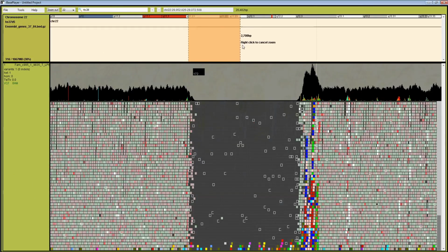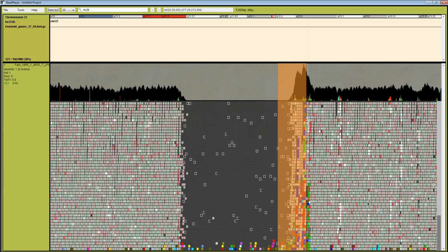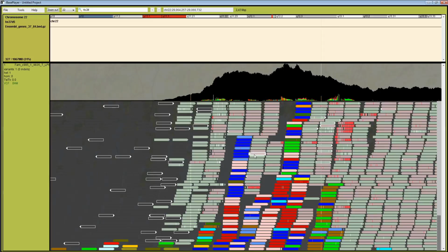Okay, so here you can see a around 6,000 base pairs long line1 element, and the reads are in dark grey because their qualities are 0, so their alignment isn't unique. Okay, but let's look at this flanking region where we have lots of discordant reads.